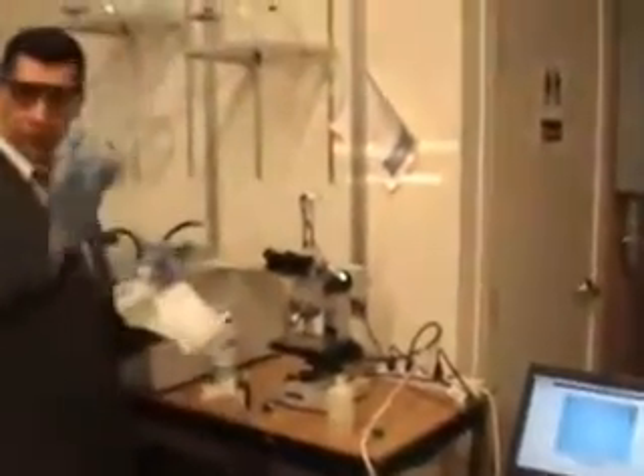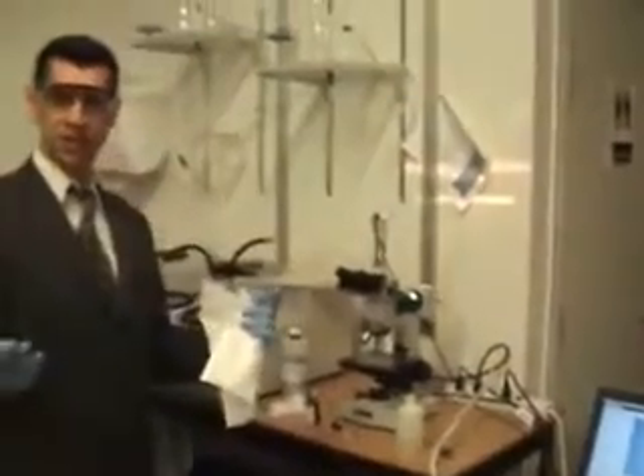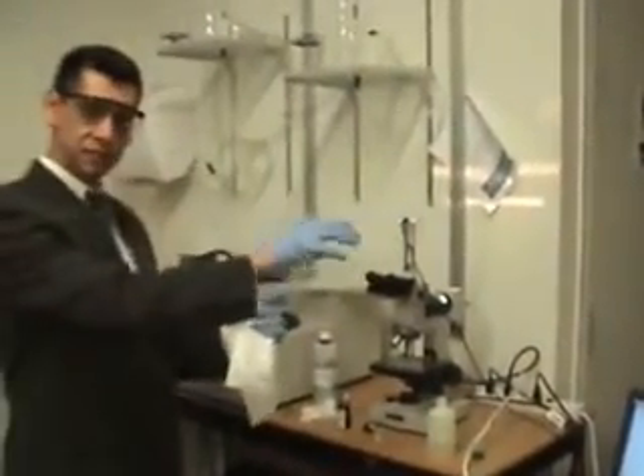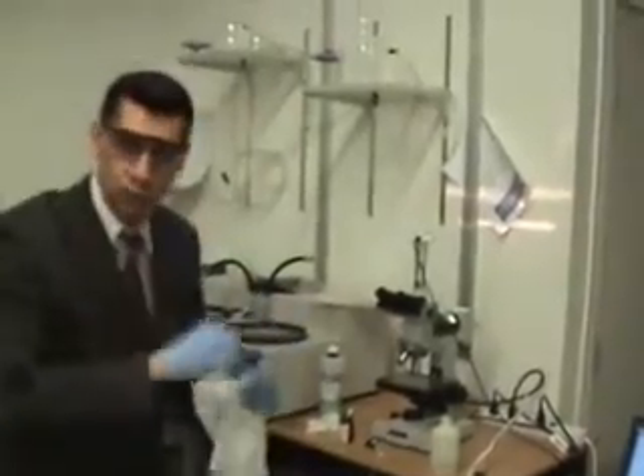With darker grains you would have seen the actual lamellar structure, but this is as far as it goes — I guess it goes to 400. For the sake of this training purpose, I would like to have one more sample and over-etch it. I want to etch it more than necessary, and you will see those white ferrite grains, due to the fact that it's over-etched, also become dark.